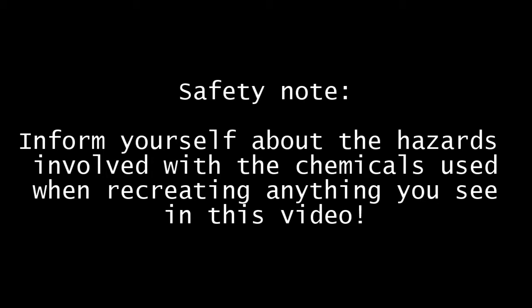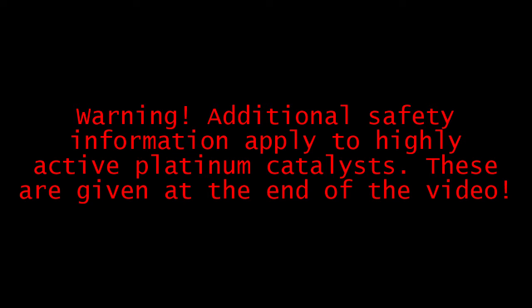Additional safety information applies to highly active platinum catalysts. These are given at the end of the video.